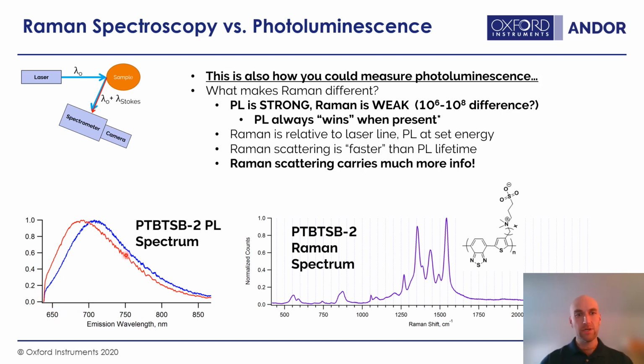So the question is, how much information would I need to characterize the spectrum? Well, I could write down the center wavelength, or the wavelength maximum. I could give it some rating for skew, like it's hilled up in this particular direction, wedged in that direction, perhaps fit a Gaussian with skew to it. And I can also include the bandwidth, so it has some very wide bandwidth here. With those three numbers, written down on a post-it note, I could probably reproduce the spectrum pretty well.